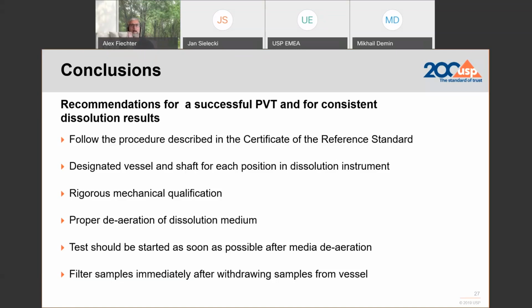Rigorous mechanical qualification, again, is really essential, but it doesn't tell you the whole story. Proper deaeration of the dissolution medium might be critical for certain drug formulations. It is critical for the prednisone reference standard tablet. The test should start as soon as possible after media deaeration. For the reasons I've given you, reaeration is possible, and you will not have reproducible start conditions for all vessels.